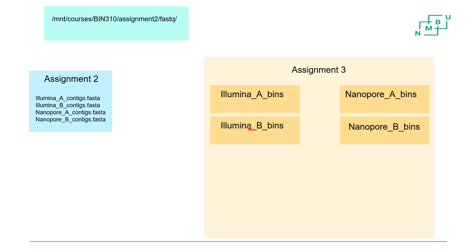Yeah, and then you do exactly the same here. You can use exactly the same script. You just change some names, right? Use the B sample reads against the B sample contigs here. But the rest is the same.